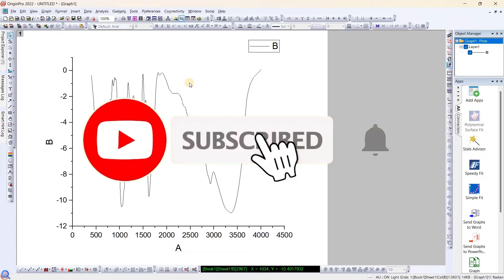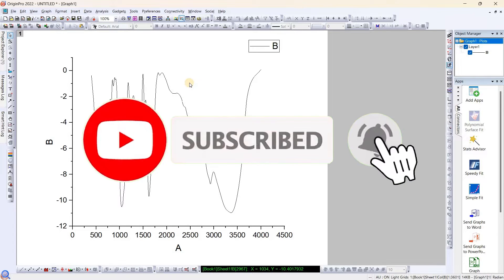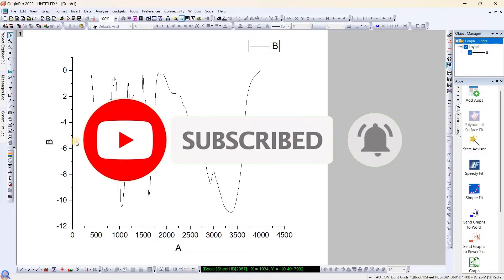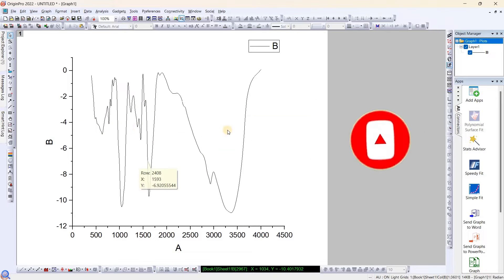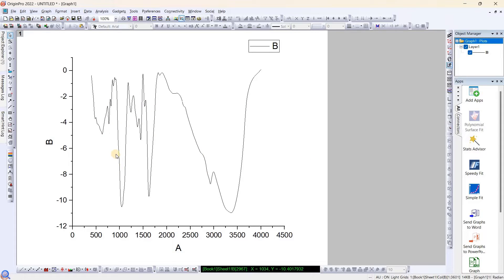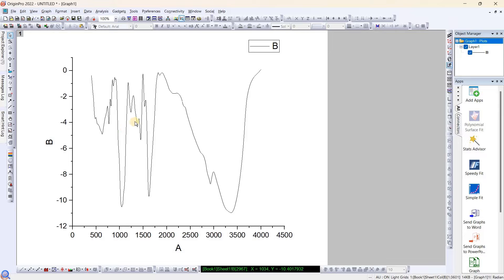Hello everyone, in this video we will see how we can find peaks and label them. Whatever kind of graph you have, if you want to find a peak at a particular location, you can find using various methods. In this video we will see mostly three methods.